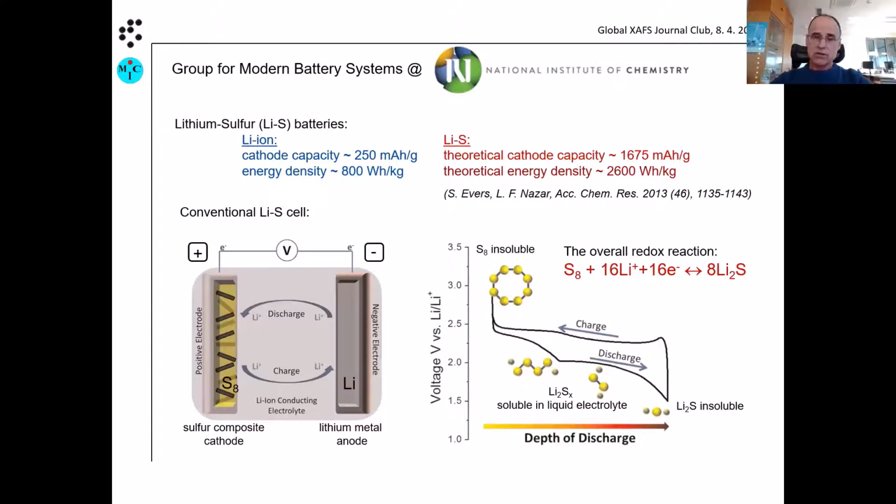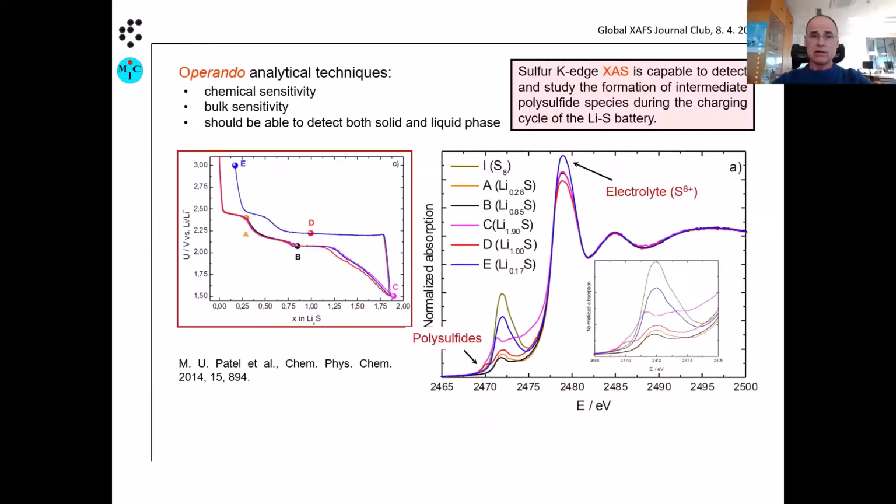Okay, so we believed that, having seen that by doing a lot of sulfur, we can certainly contribute to this field. And so we tried to enter. Okay, here, sorry. So the technique that is used regularly is, of course, X-ray absorption.